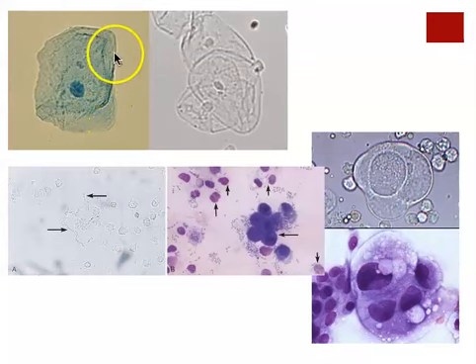Notice that this cell has sort of an unusual shape. It's quite flattened. It doesn't have a nice round, plump, three-dimensional shape. It looks sort of like it's folding in on itself. It's collapsing a little bit. This is an epithelial cell that has aged. It's closer to the upper layers of your skin, for example. It's preparing to be sloughed off.